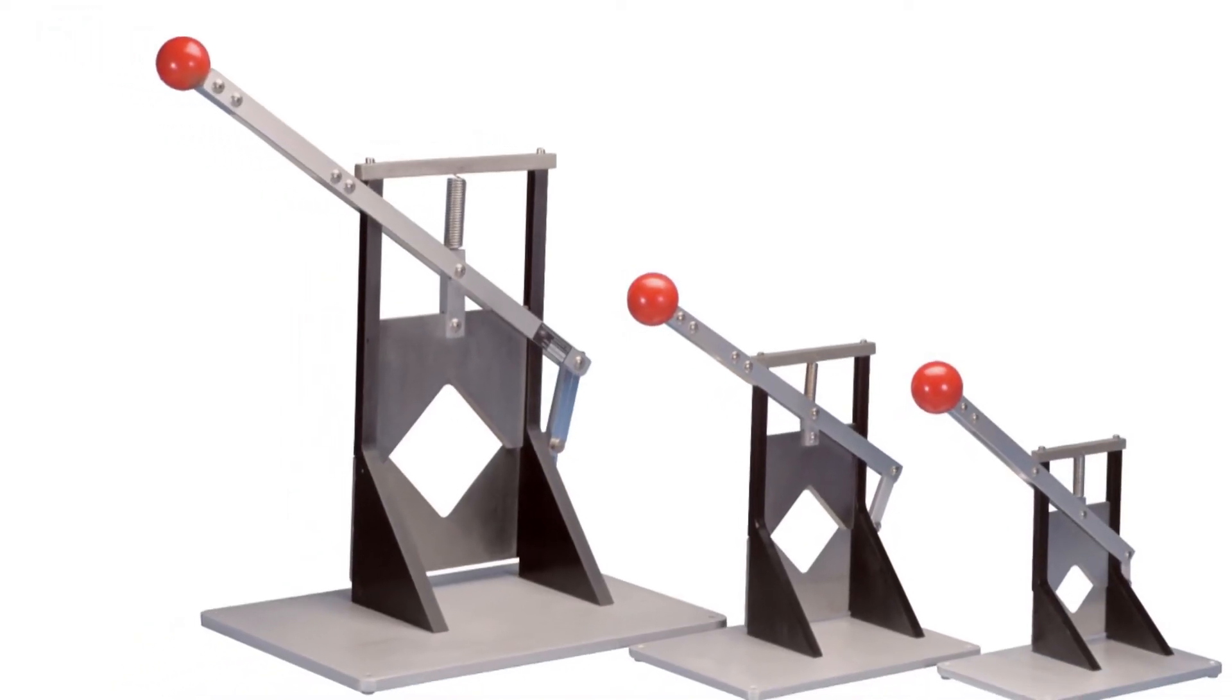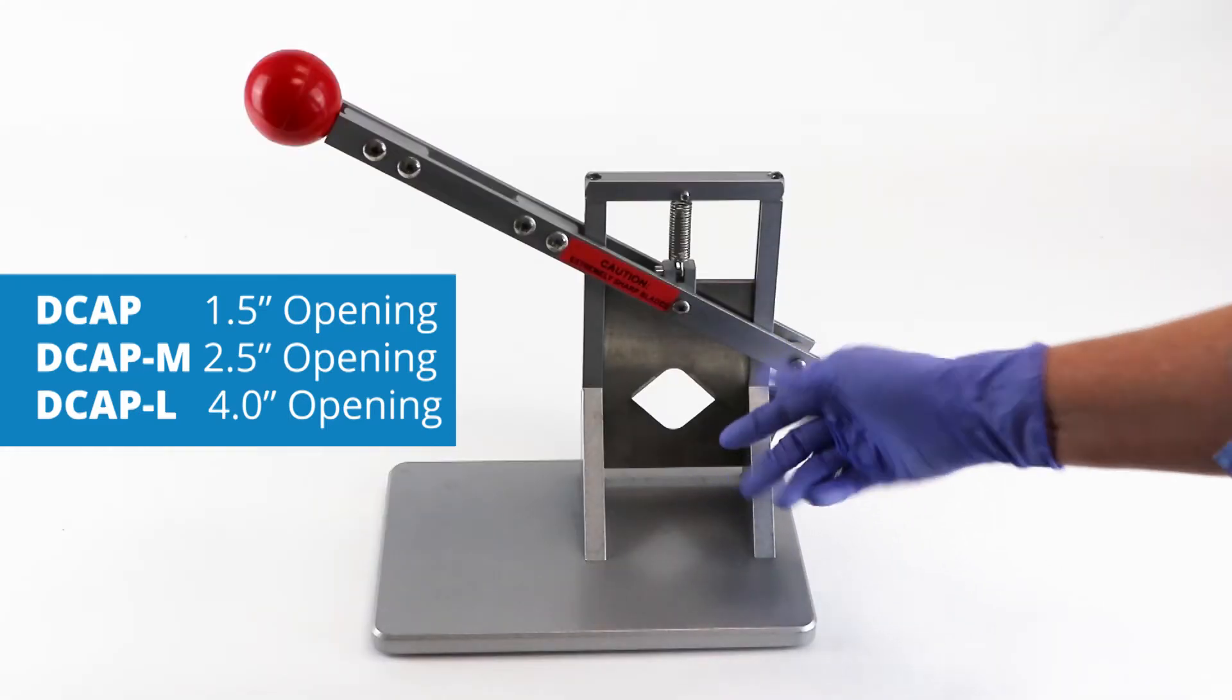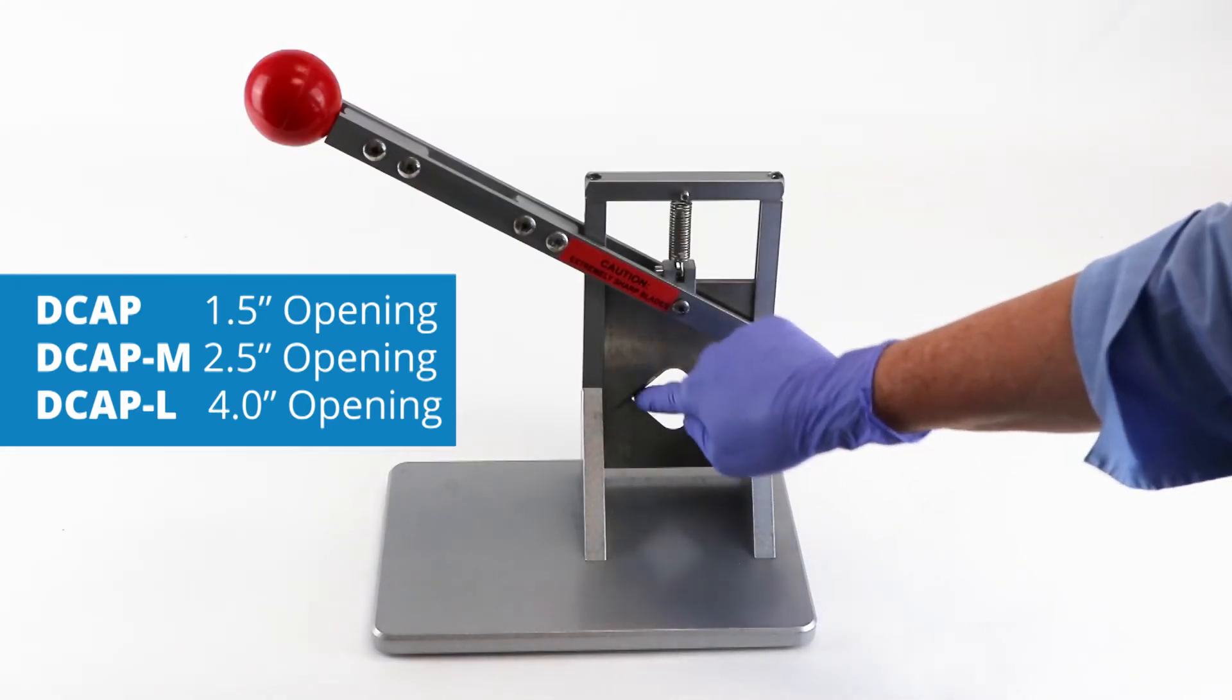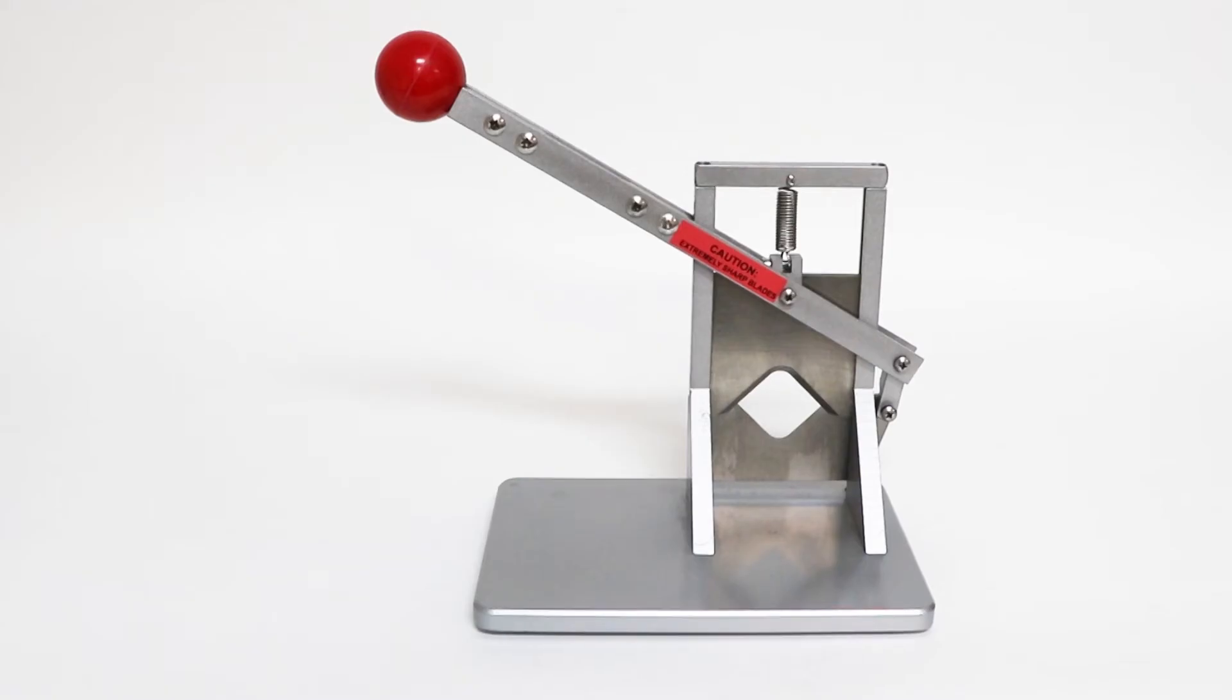These guillotines are designed for small animal research and they come in three sizes. This is a small with an inch and a half opening. Larger ones are two and a half and a little over four inches.